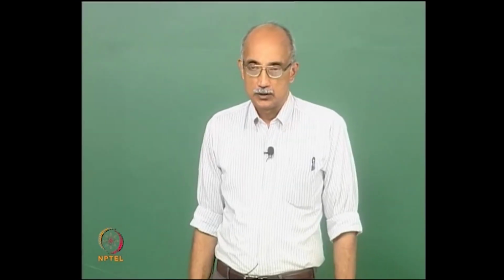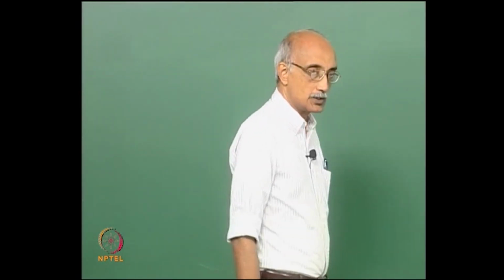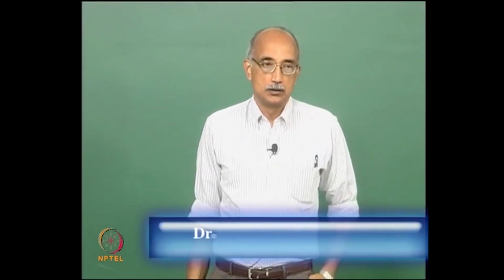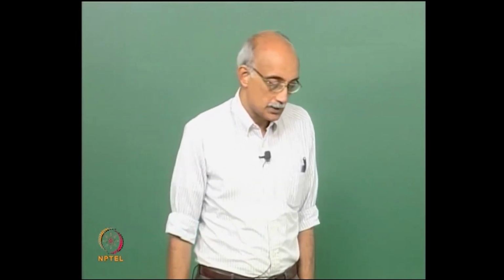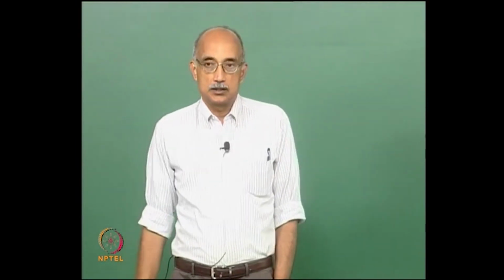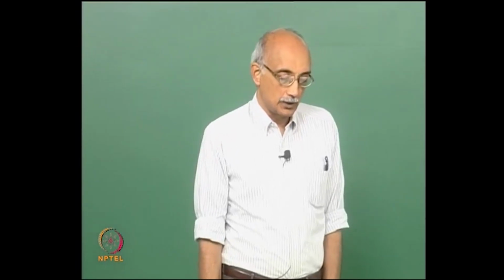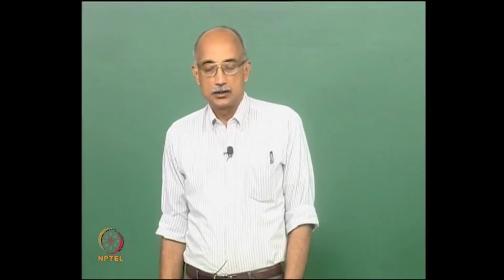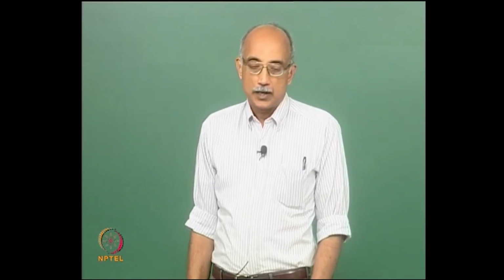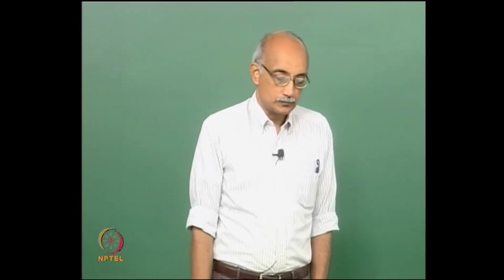Welcome to the 10th lecture in our particle characterization course. In the previous lecture, we continued our discussion of particle size characterization, and the key point that we were making is that given the uncertainties involved in estimating the sizes of particles using light scattering techniques, it is very important to use a particle counter or size analyzer which is properly calibrated as well as correlated against a traceable standard.